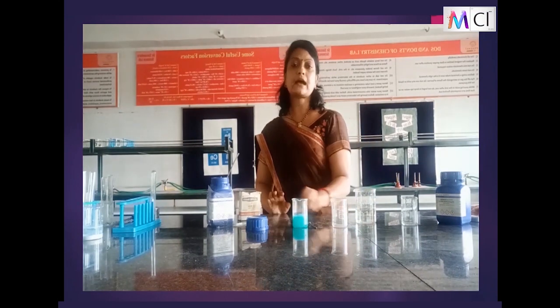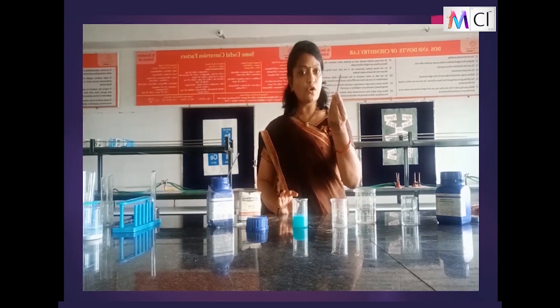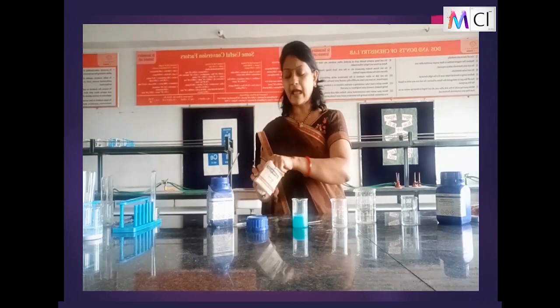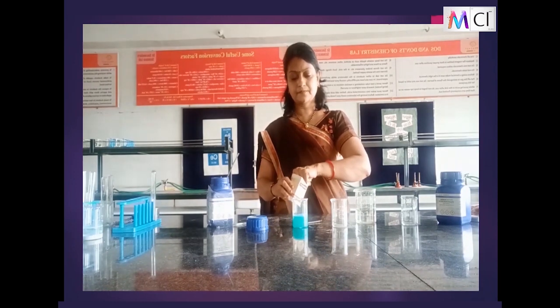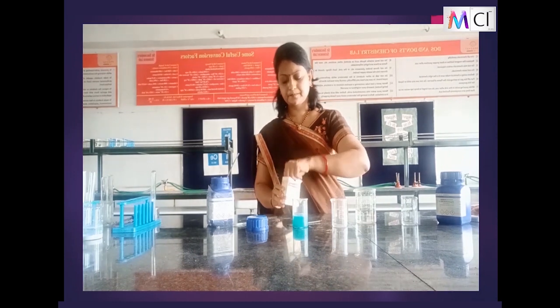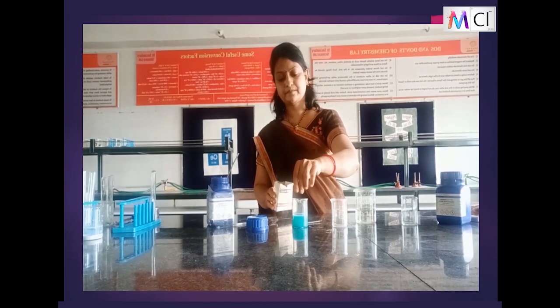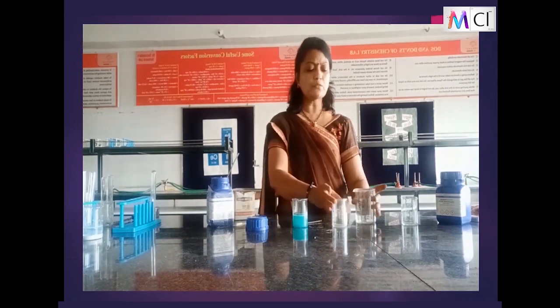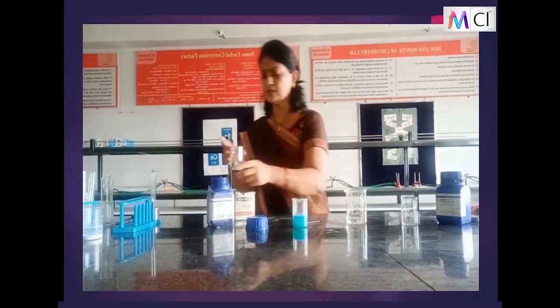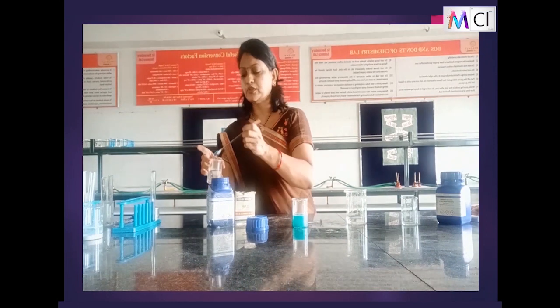To this, I can add an iron nail, or I can add iron filings also. I will add iron filings first, that is small pieces of iron metal. I'll make one more solution in which we will dip the iron rod also and see, so you can observe both cases.